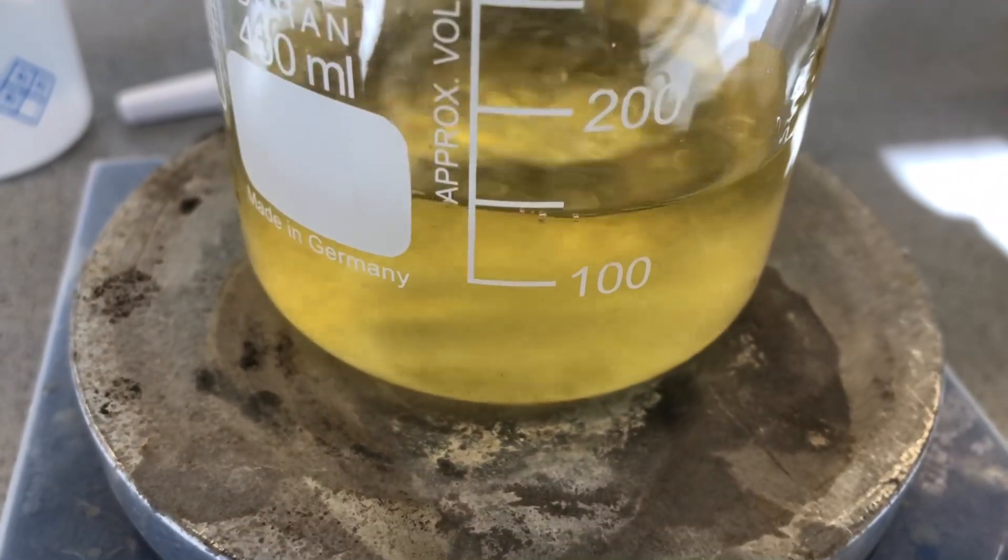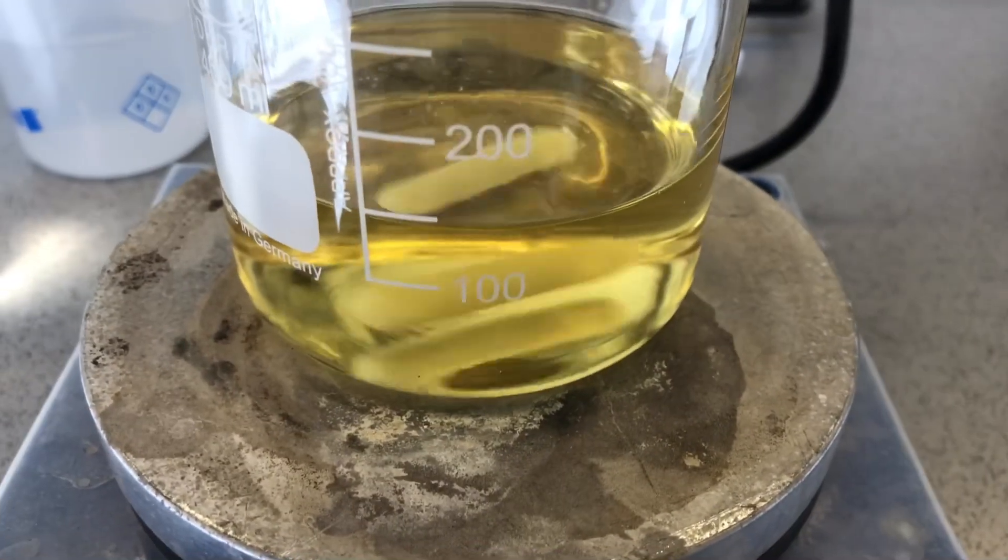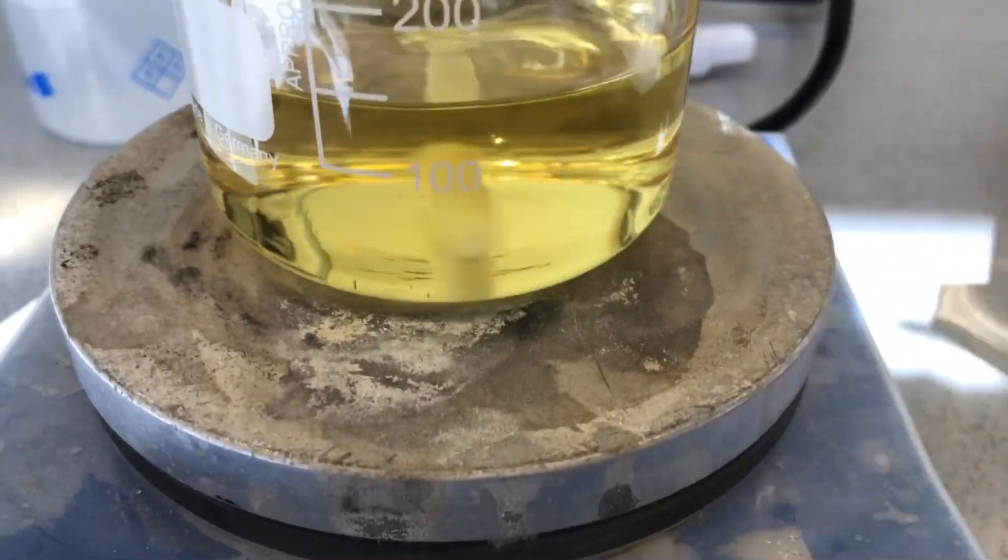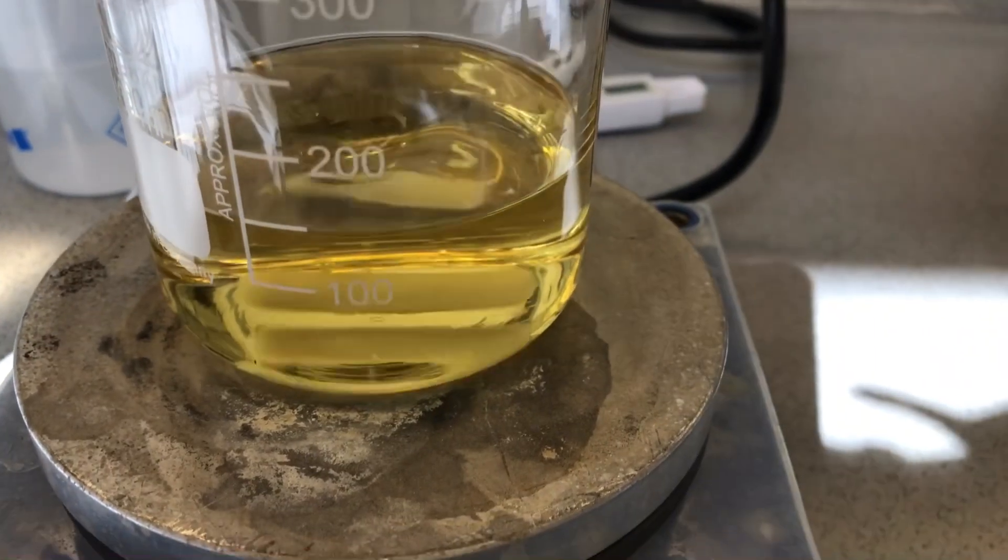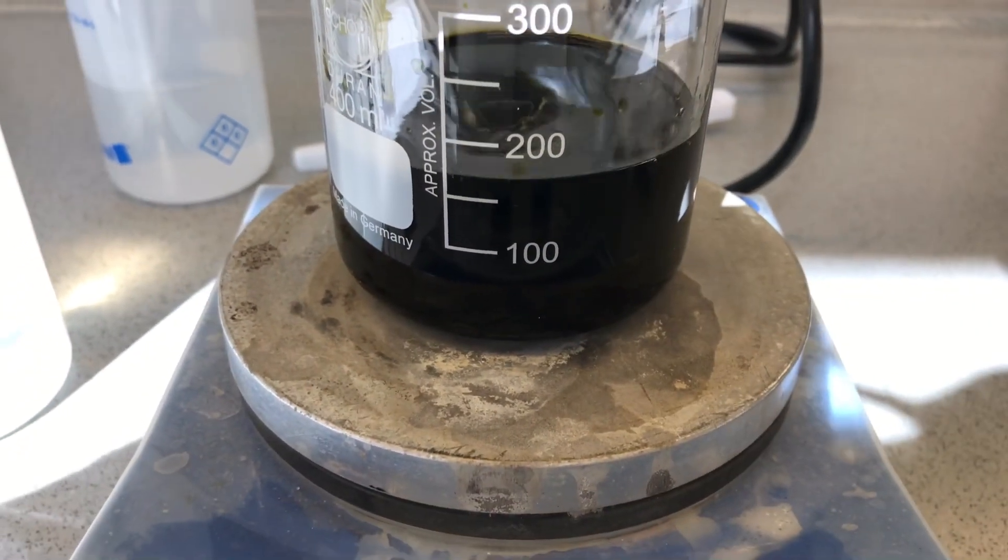About 45 milliliters of water were added while stirring. 18 milliliters of 2-molar sodium hydroxide solution were weighed out and the magnetic stirrer was turned on. When the sodium hydroxide solution is added, you immediately see this color change.